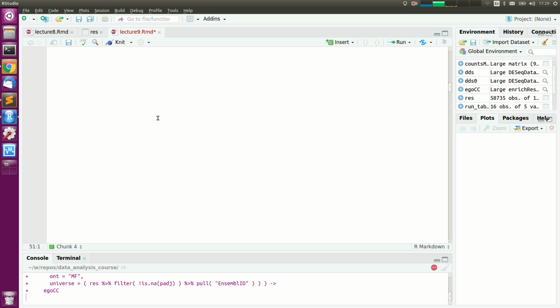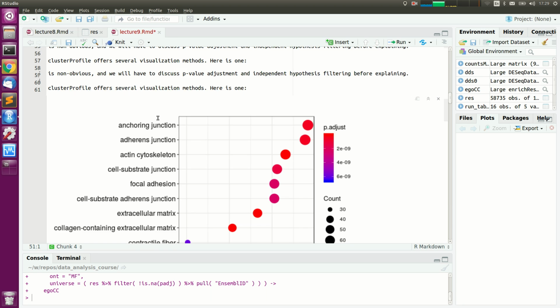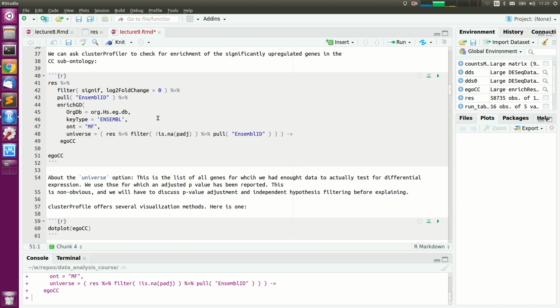If we took all genes which are annotated on Ensembl, basically everything is enriched, because Ensembl is full of genes which are never expressed and hence will never appear in our GO analysis, and we don't know anything about them. So it's important to tell it which genes we've actually been looking at, and not simply say it compares to all genes. And this is what's called the universe: all the genes for which we could in principle have noticed that they are upregulated.